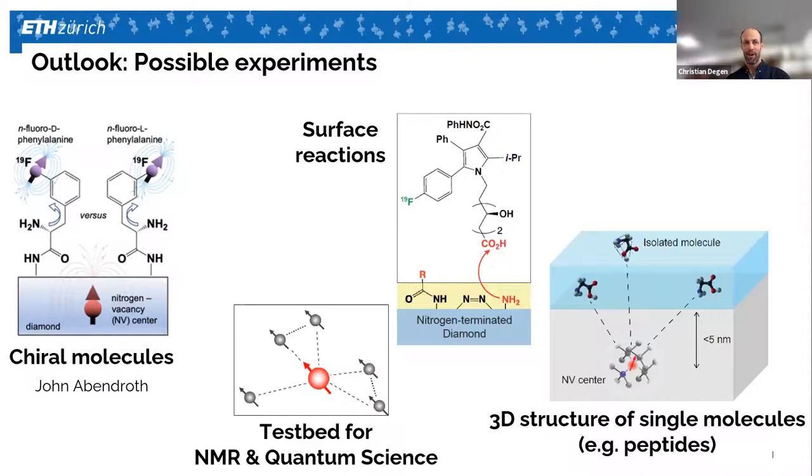And then I think there were efforts of trying to do DNP, so use NV centers as resources that you can optically polarize and then do DNP. But I think this has not been very successful because it's very hard to get the DNP out of the NV center through the diamond surface and into a sample. So maybe some words to powers. Okay, good. Because this is something that the NMR community will be very interested in, as everyone knows, the Holy Grail.